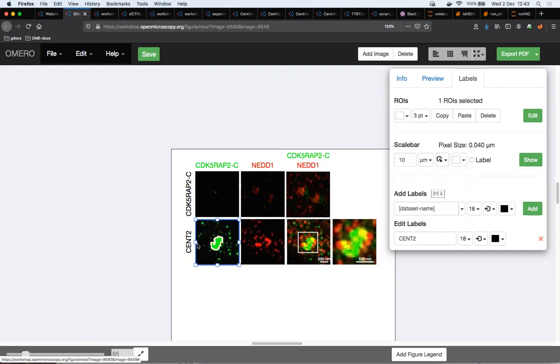White was in the end the best, and I will make it a little bit thicker, 5. Okay, great. So this is a little bit over the top, but it shows the point. So I just added the region of interest, which is coming from the Fiji segmentation. You can see that it's fairly sensible on this one, and I'm kind of happy with this plot.